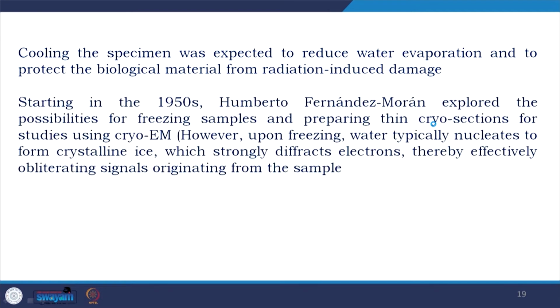Now, starting in the 1950s, Humberto Fernandez Moran explored the possibilities for freezing samples and preparing thin cryo sections for study using cryo-EM. However, upon freezing, water typically nucleates to form crystalline ice, which strongly diffracts electrons, thereby effectively obliterating, meaning the signal originating from the sample is lost.